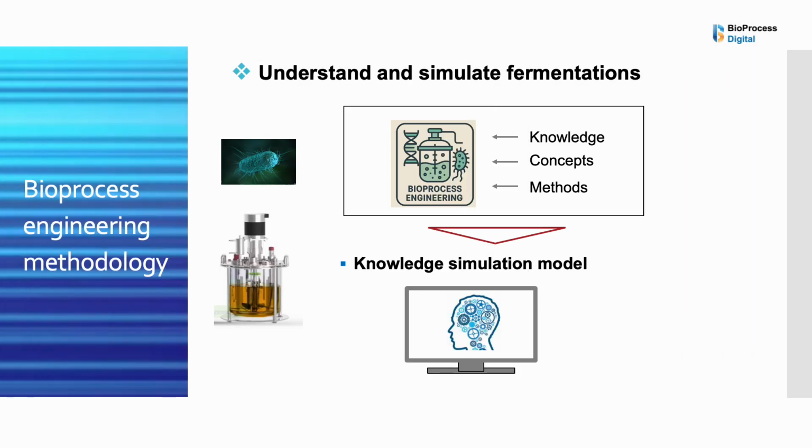Bioprocess engineering has evolved as a scientific discipline that provides a structured framework of knowledge, principles, and methodologies for the simulation, scale-up, and optimization of microbial fermentation processes. To accelerate process development and scale-up, bioprocess engineering employs mechanistic, knowledge-driven simulation models grounded in the understanding of key physicochemical and biological phenomena.